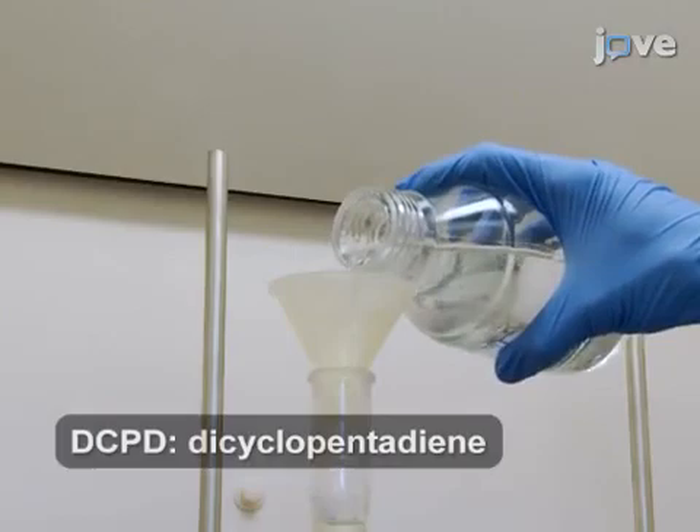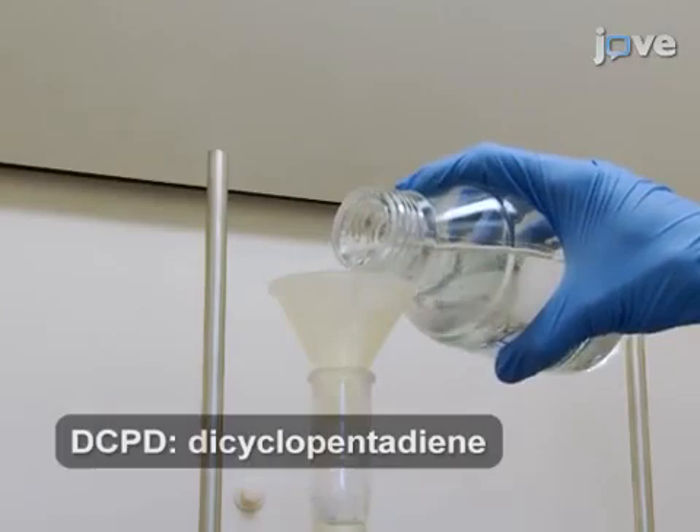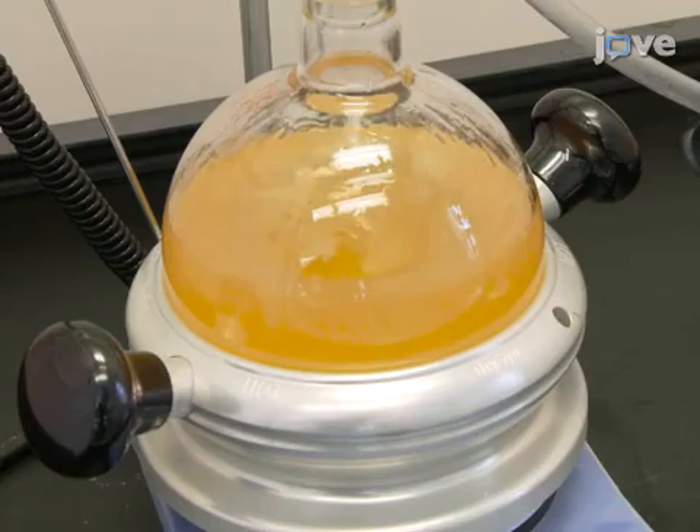Once the refluxing has settled, add 300 grams of DCPD. Then increase the temperature to 170 degrees Celsius for 16 hours. The solution color will change from clear to yellow-brown.